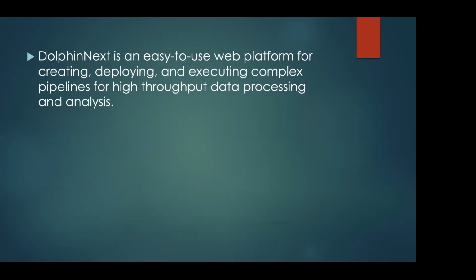Okay, so to be able to do everything, we created DolphinNext, an easy to use web interface to create pipelines with a drag and drop interface, and deploy your code to GitHub to share with the world together with your publication, and also execute those pipelines anywhere you want in the world.